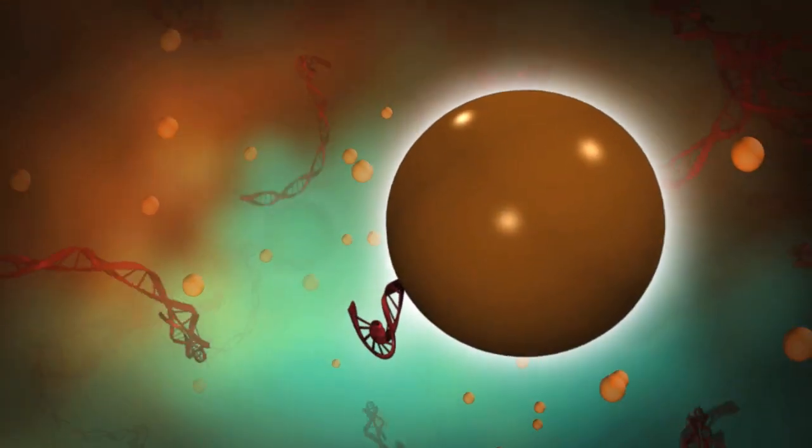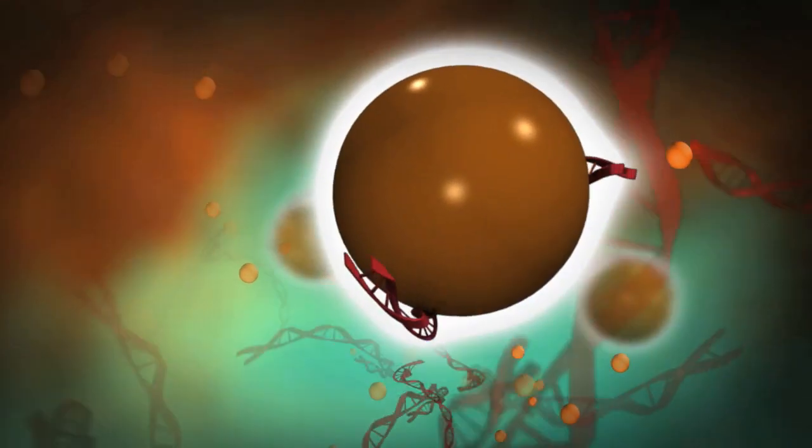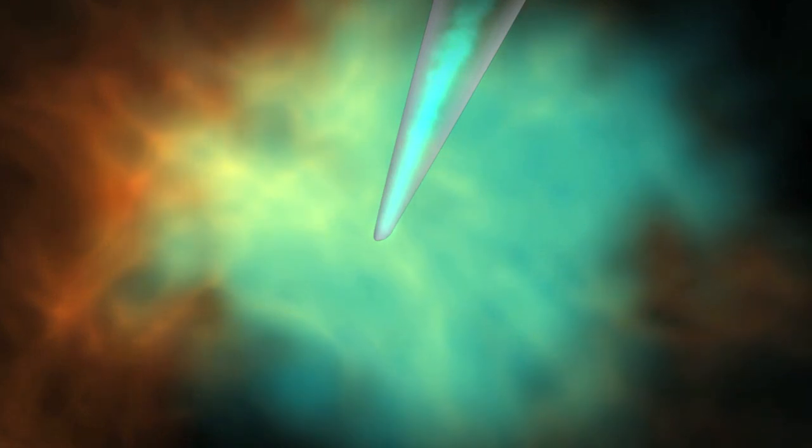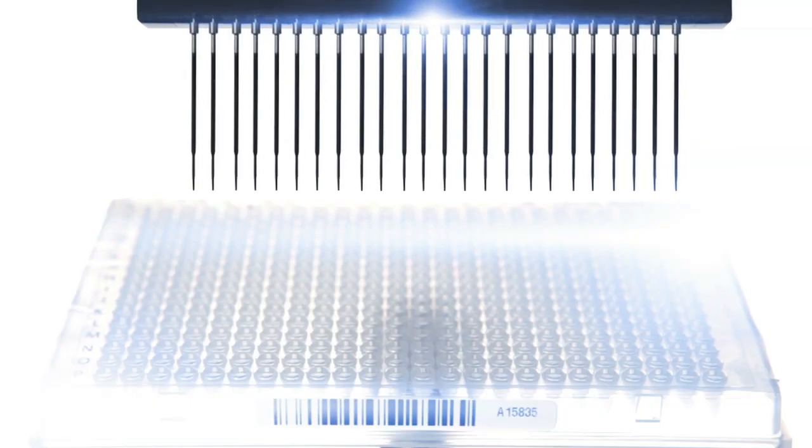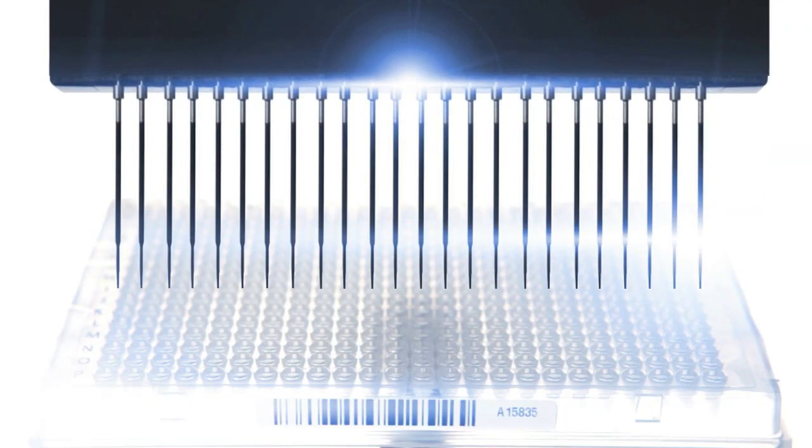Once the DNA is purified and extracted, the robot builds a plate for real-time PCR reactions by marrying your purified DNA with the custom probes designed for your mutation.